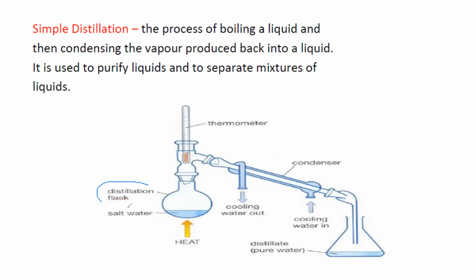The distillation flask is a round bottom flask. It is used to have a mixture in it. In a distillation flask, we have a mixture. What mixture? For example, a salt water or salt solution. So the purpose of the distillation flask is to hold the mixture.